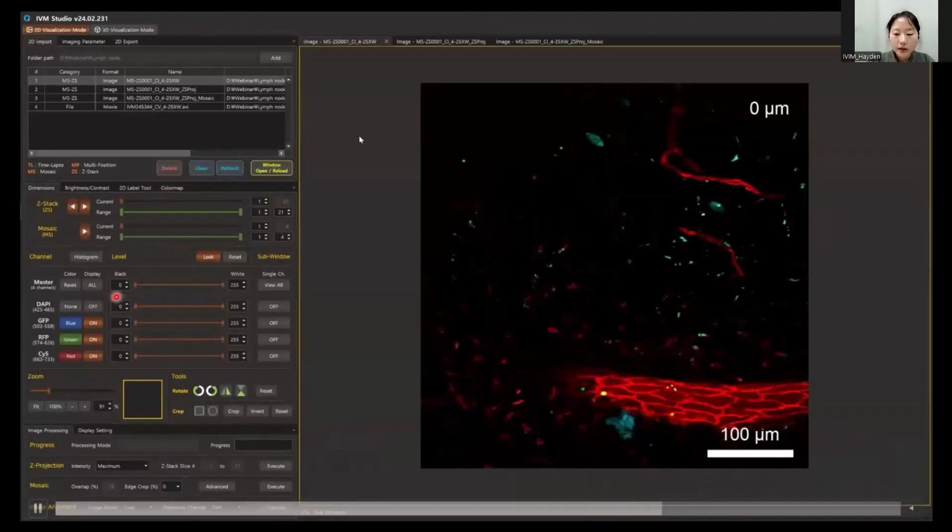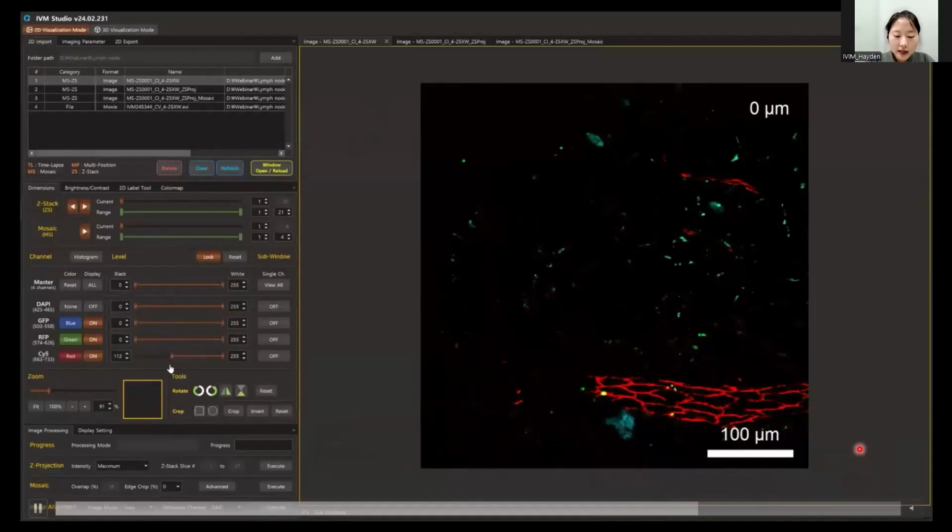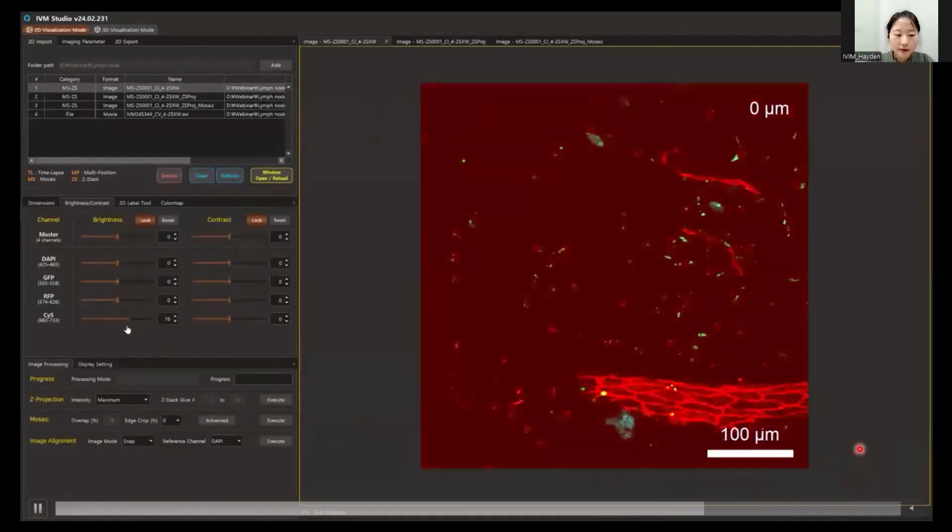files. So within the software, you can adjust and improve the quality and visibility of the images, such as modifying the color balance and the brightness, the contrast of each individual image. So with adjusting the color balance part, you can see the balance is changed during this processing.